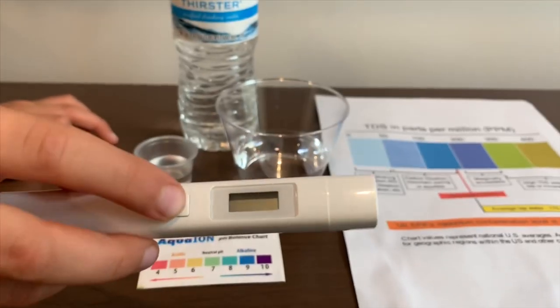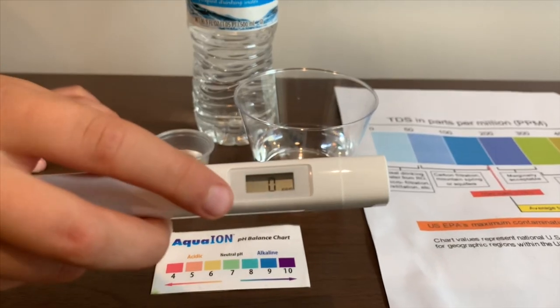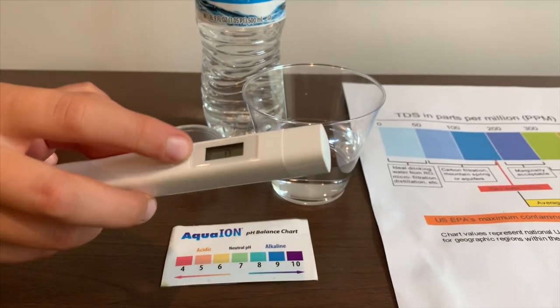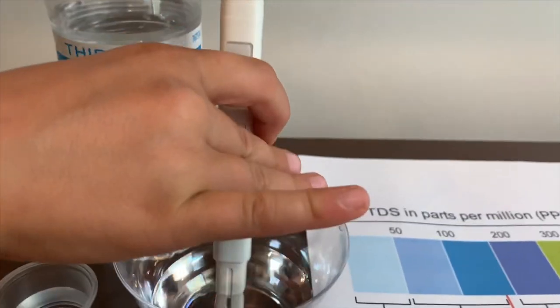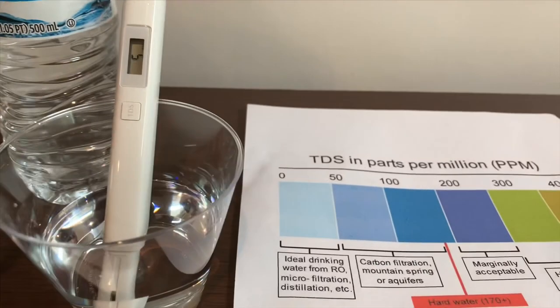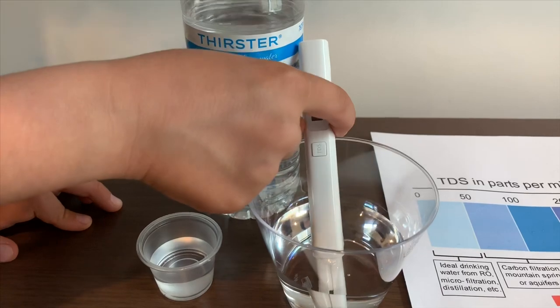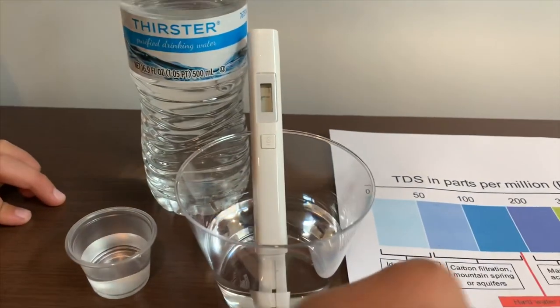If you want to buy this TDS tester, check the link down below. Turn on the TDS tester, make sure it says 0, and put it in. It reads 5 — that is ideal drinking water. It just turned to 7 — that is also ideal drinking water.